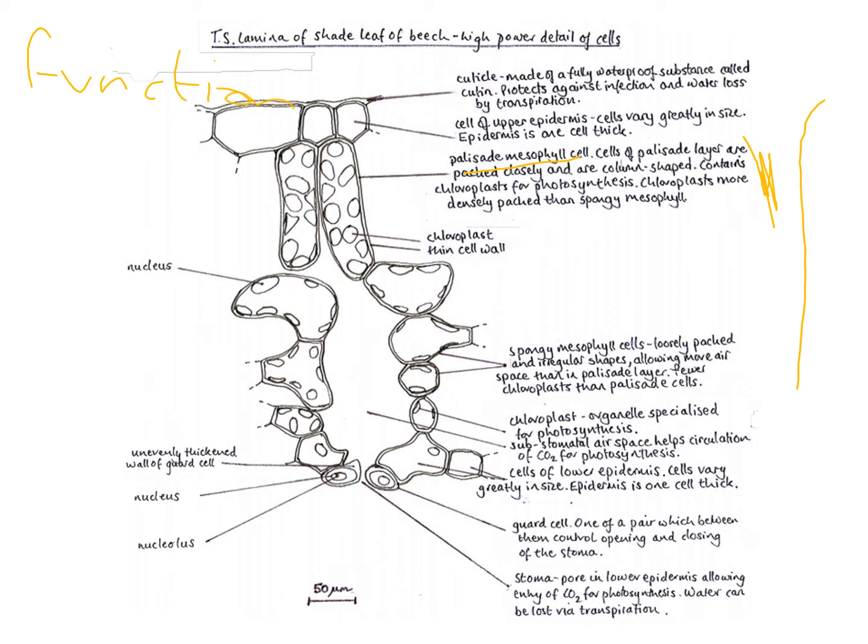It can be colour. It can be something descriptive to allow you to identify it. Okay, now the other good thing that they've done is they've added a scale bar here. But you can see they haven't drawn every cell. They have drawn a representation of what they could see. Okay?